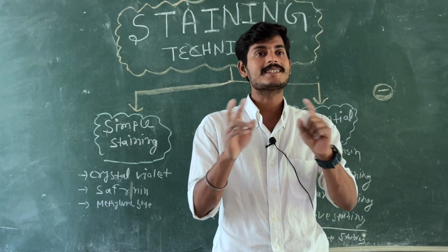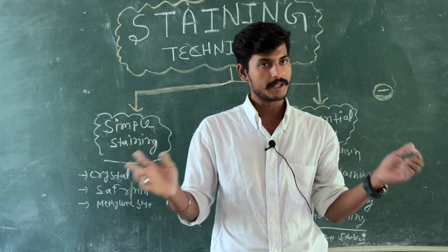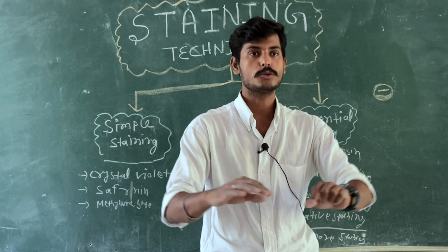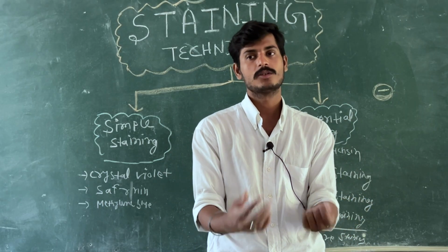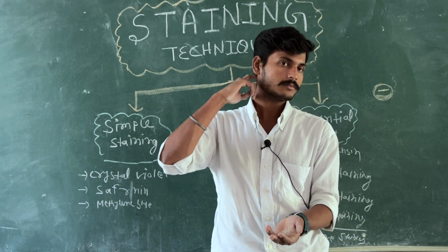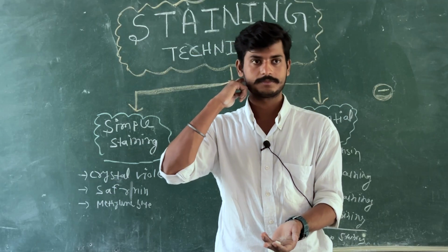Differential media to differentiate between two organisms. A mixture of organisms comes to us, but we have to differentiate. In order to check them separately, we are using differential media. An example is thioglycollate broth. Any other?